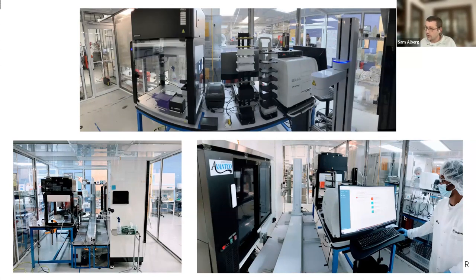Science Corporation's operators, like Mo, our friend at Science Corp, run their experiments on Monomer software, which is connected to this work cell and allows them to carry out cell culture processes in an automated fashion.